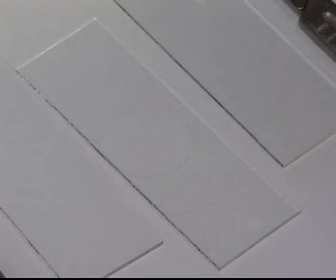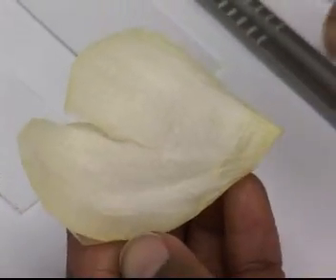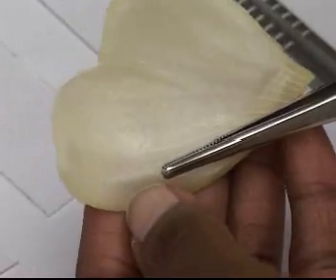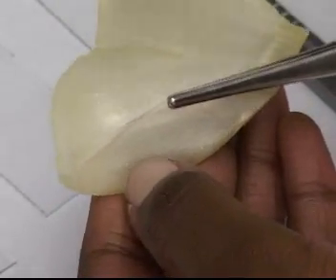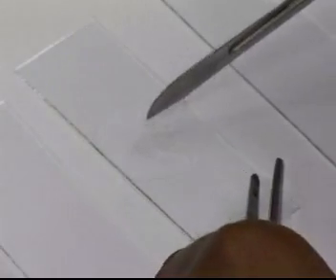First, we place a few drops of water onto the middle of the slide using the dropper. Then, we carefully peel the inner epidermis from one of the leaves of the onion using the forceps and trim it using the scalpel. The piece of onion epidermis is then placed into the drop of water on the glass slide, and the slide is covered with a cover slip as follows.